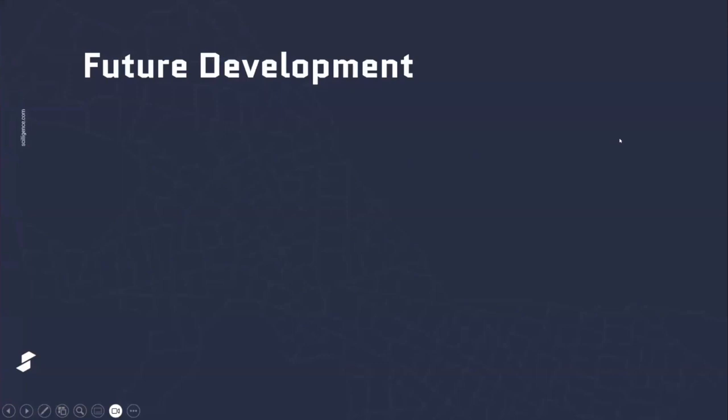And now, future development. Our next steps will be the ability to navigate the ELN application through speech recognition. This would be using voice commands to get around the ELN application, moving from tab to tab, moving to different parts, selecting things and so forth.